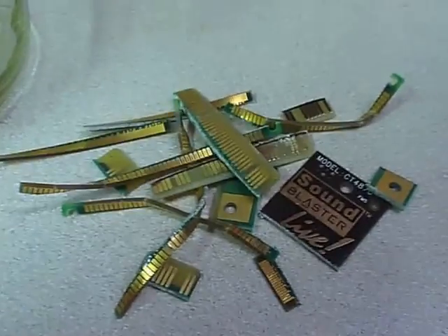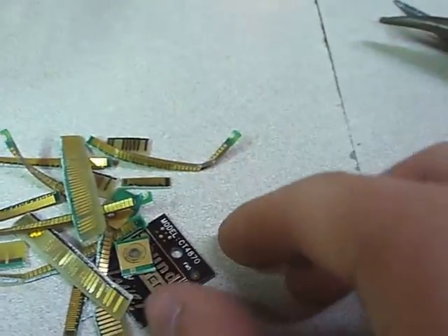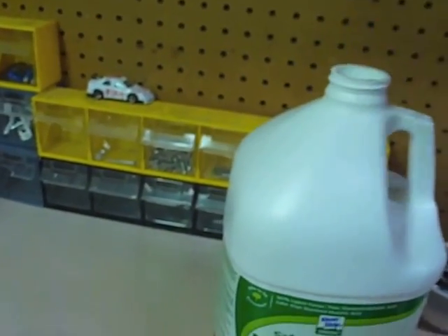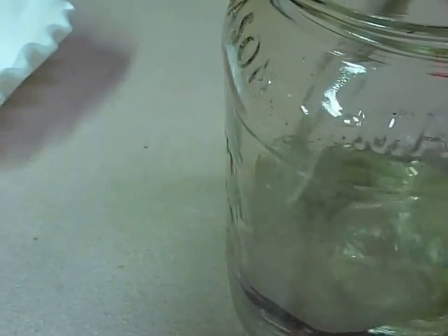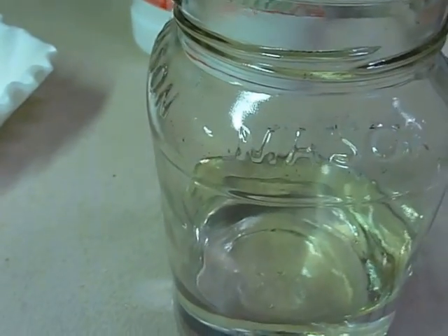This won't be a very big batch, but after you cut the gold fingers and just various other gold bits off, you're going to want to take your muriatic acid and fill a glass container with it. I don't have that many, so I'm not going to use too much of it — just enough to cover all the stuff.